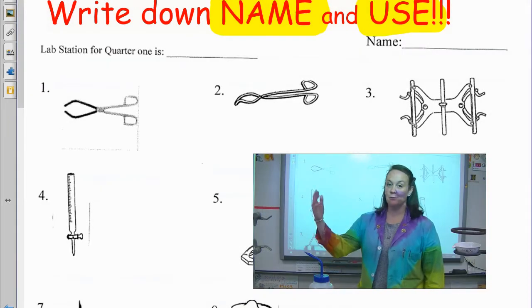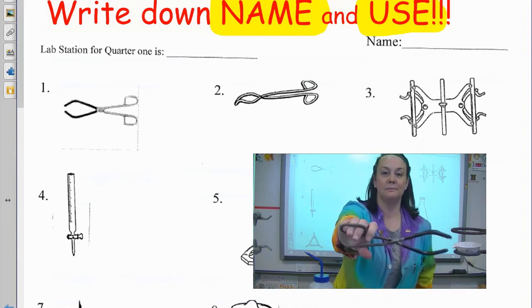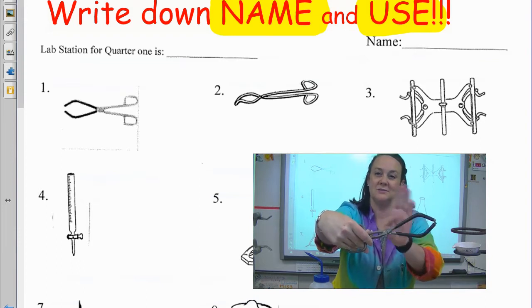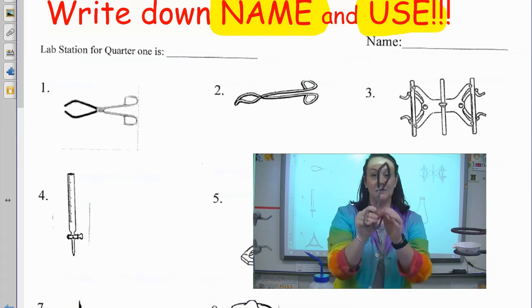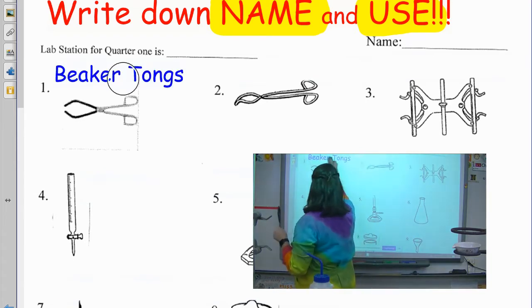All right. Let's get started. So the first one we have here, they look a little bit like this. This is your apparatus you have. Please notice that they have a little bit of rubber on the ends. Try to get that in the picture. And then it does have a clamp here on the end or place for your fingers on the end. These are what are called beaker tongs. So what you're going to want to do is write beaker tongs here.